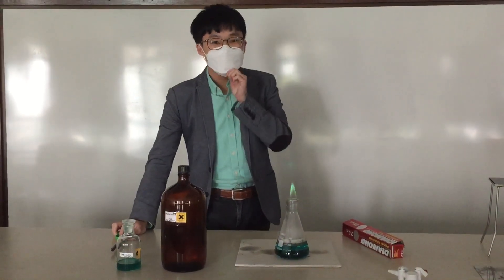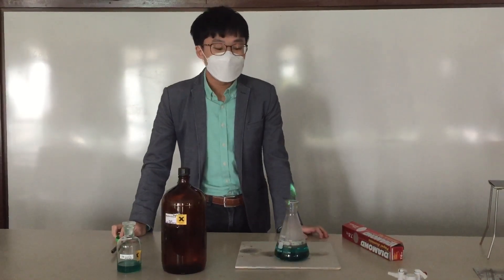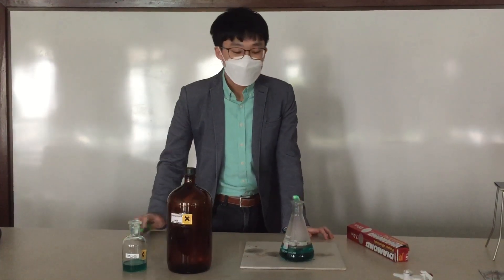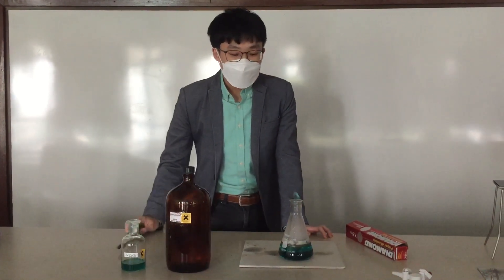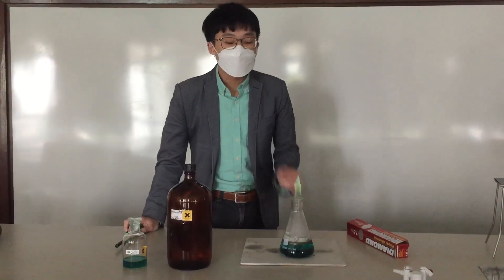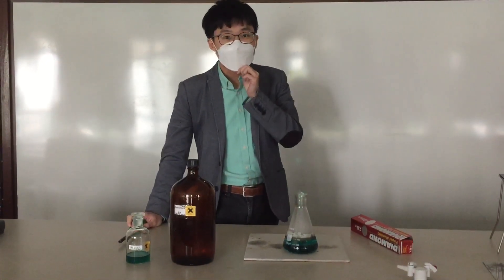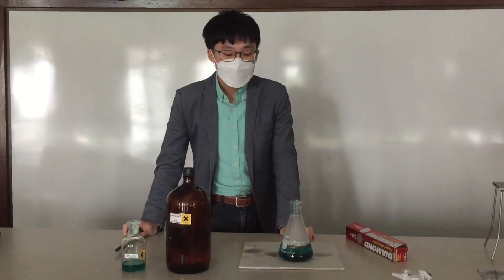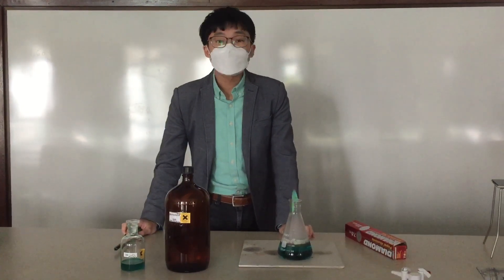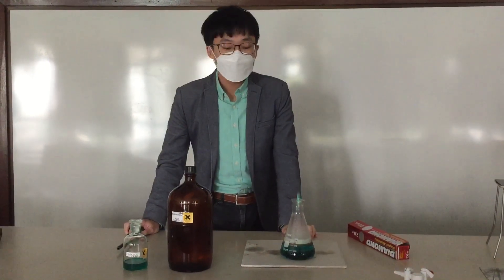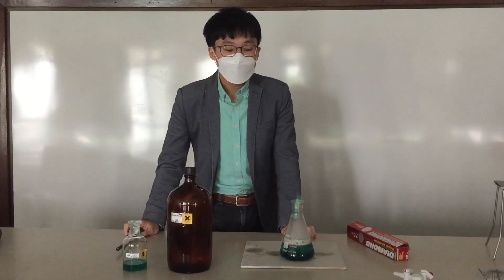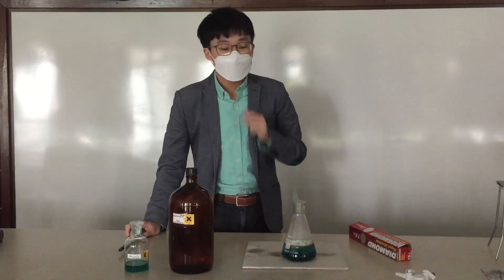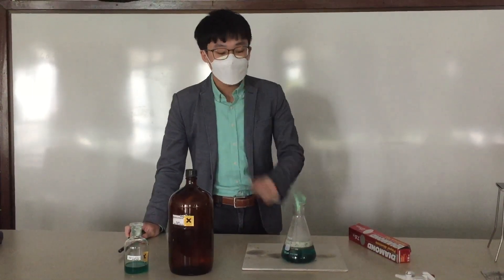This is because aluminum reacts with the hydrochloric acid inside, which generates hydrogen gas. At the same time, with the presence of copper(II) chloride solution, the copper(II) ion gives a very beautiful bluish-green flame.